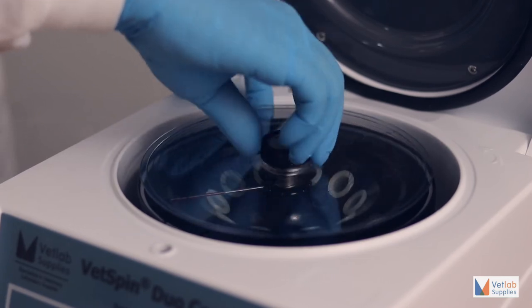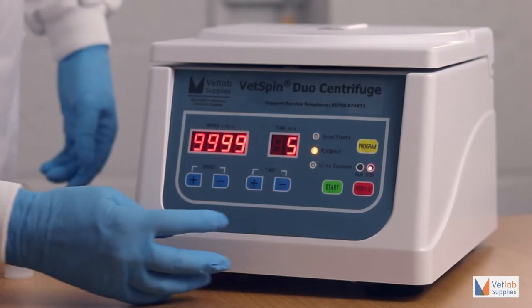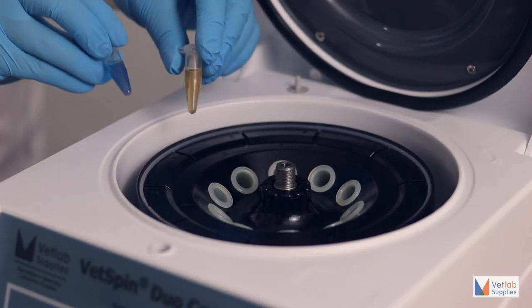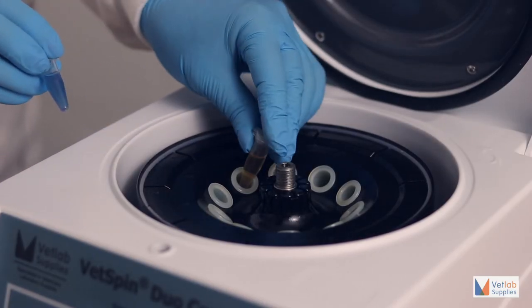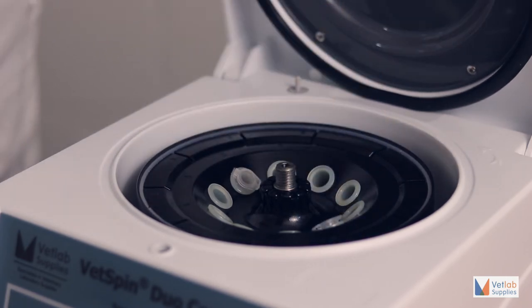This easy-to-use centrifuge has three preset optimized programs available for spinning serum and plasma, hematocrit and urine sediments. Simply select the preset program of your choice, remember to balance the tubes, and then press the start key.